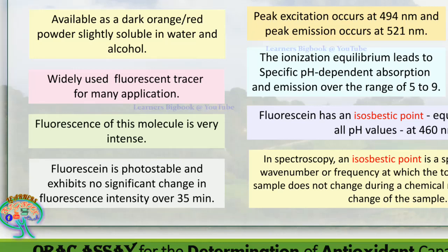There the light passes through the sample, so the photons, the photovoltaic energy, pass through the sample, which could cause a reaction within whatever ionized form of the molecules is present.